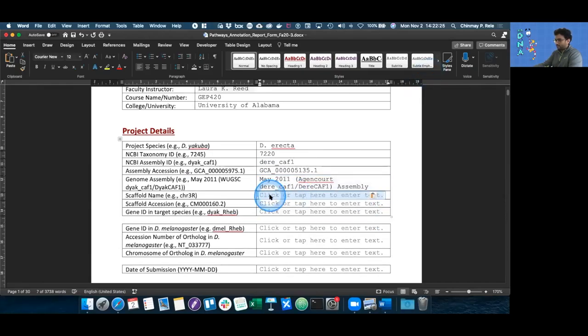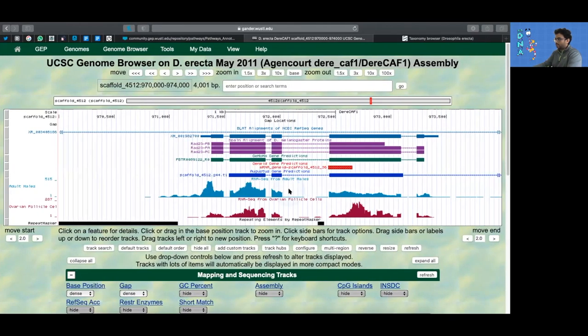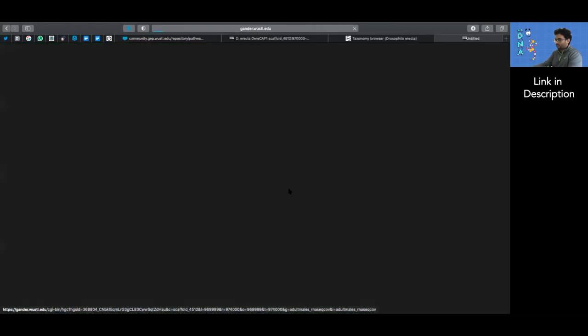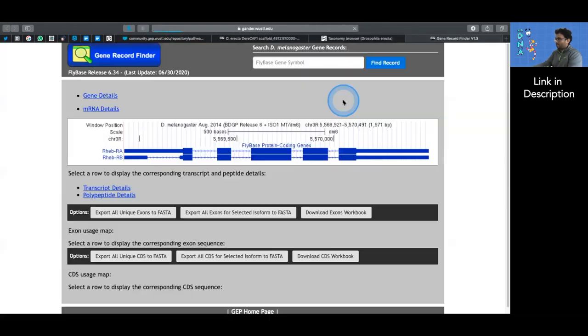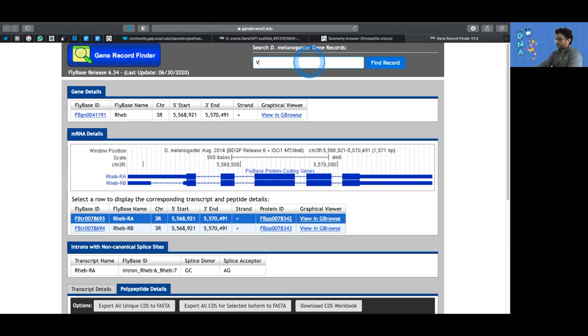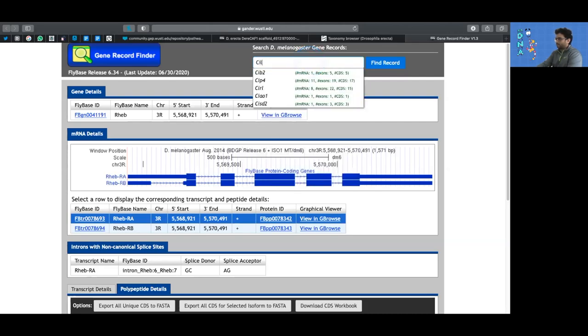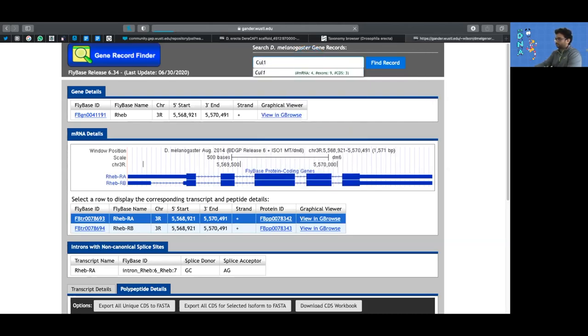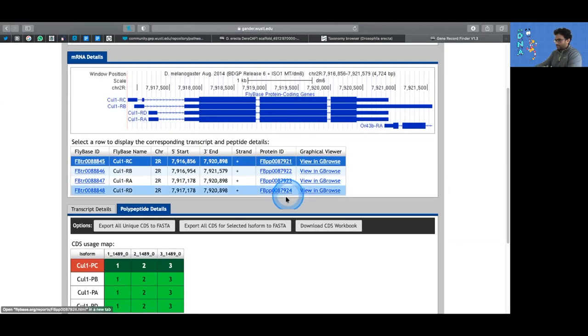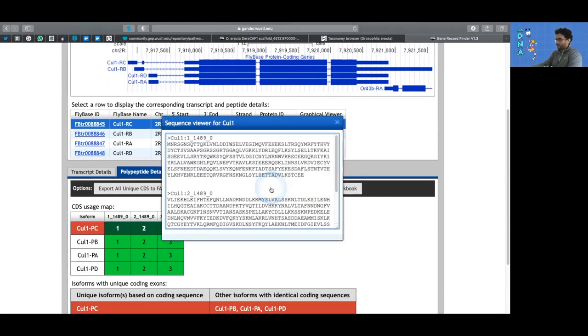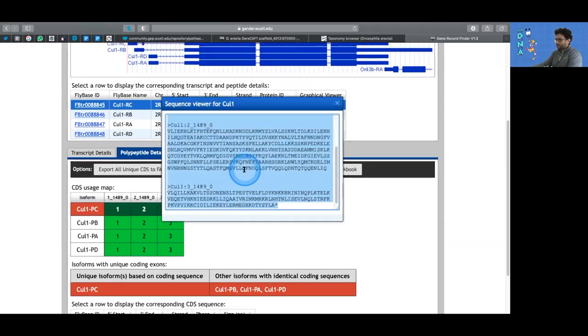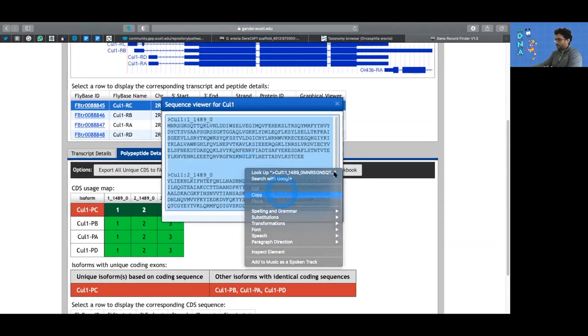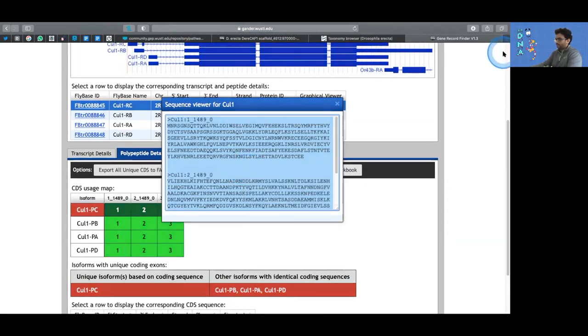Getting the scaffold name that your gene is on is a little more involved. You need to go to the gene record finder and type in the name of your gene. In my case, it's going to be CUL1. Just remember that your gene name is going to be case sensitive. We're going to BLAST it against my target assembly. Let's take the entire FASTA sequence and copy all of it.